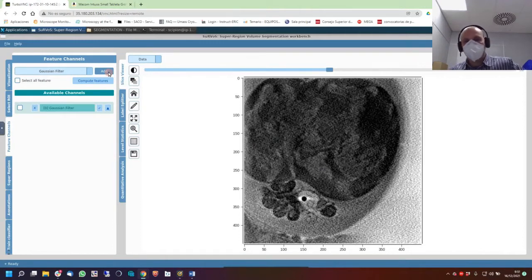It creates an extra layer, extra volumes that you can use if you want. We'll see it later. They will create the filtered volumes, and you can filter in cascade mode: first you use a filter, then with this result you can use another one, or go back to the first one.